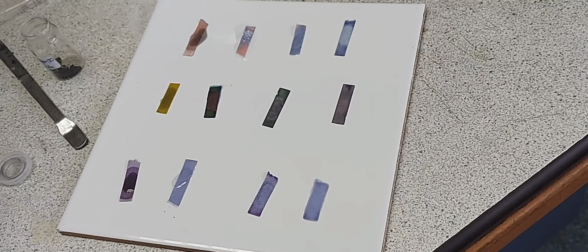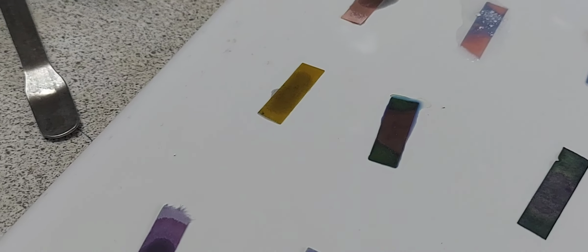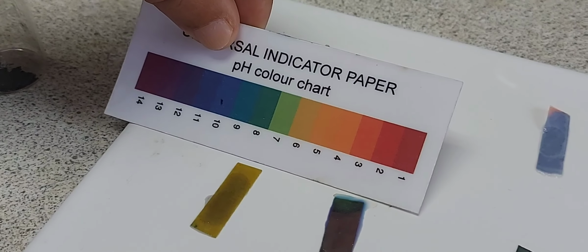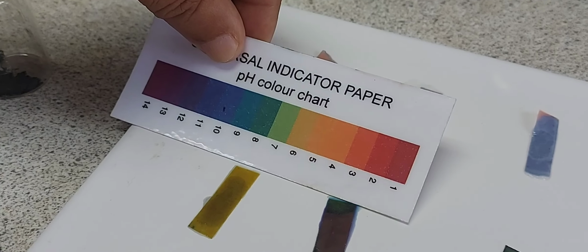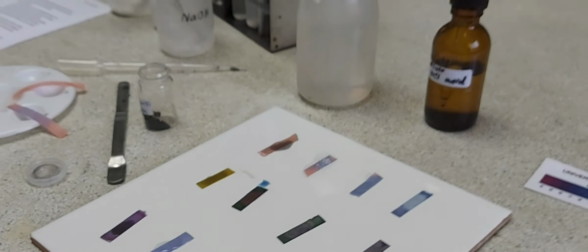So you can see that the red litmus paper is turning blue, not that blue, but still it is turning blue. The pH paper is showing a very light green color. So it must be in the range of 7 to 8.